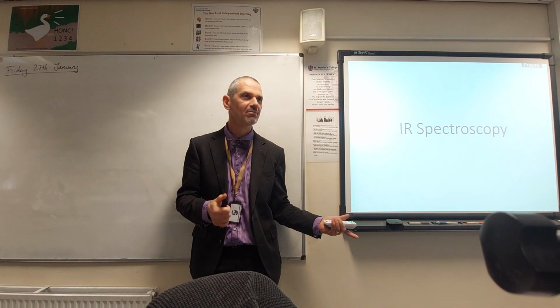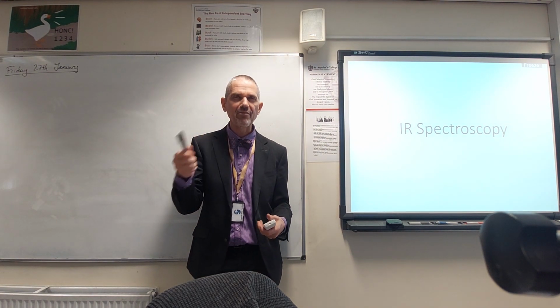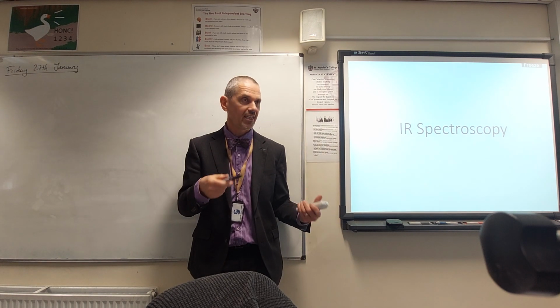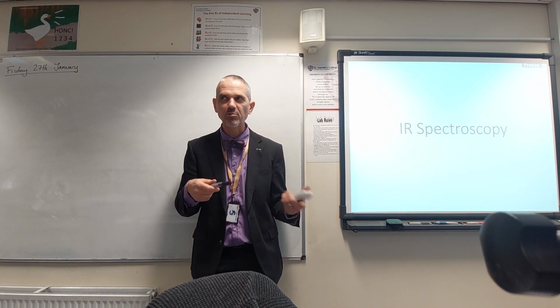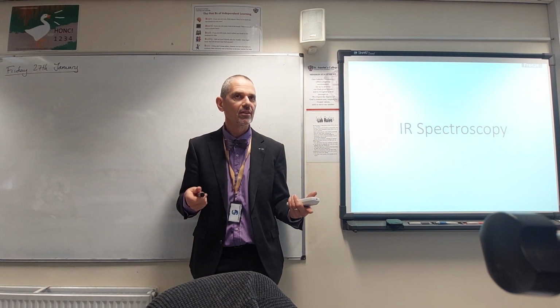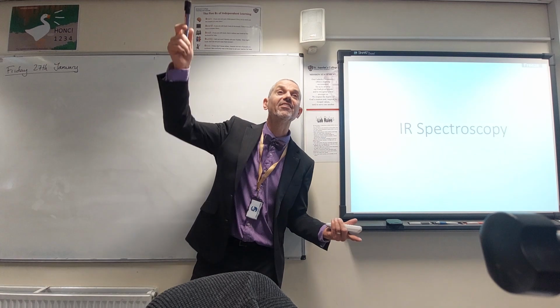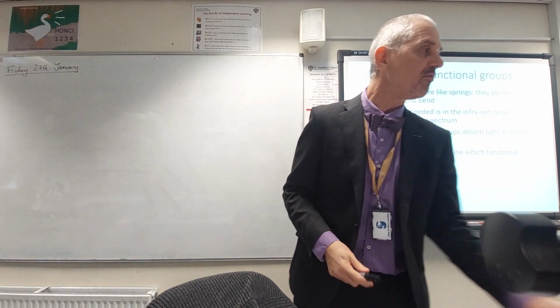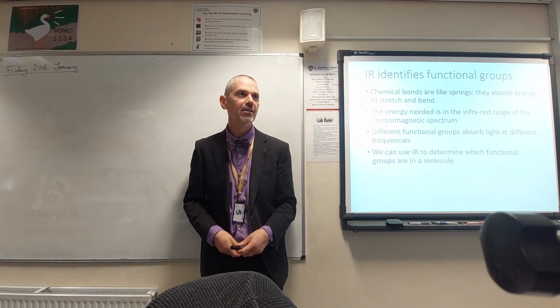Anyone feel free to jump in. Yeah, we use the wavelengths to work it out. I'll come to the details in a moment. But what's the key thing we're trying to learn here? Yes, we get absorbance at a particular wavelength or frequency, and that enables us to work out a particular bond. What does that tell us about the molecule? What's in it? In terms of its structure. In terms of? Functional group. Thank you. Okay, so we're looking at a way of learning functional group. That's the whole focus of infrared.